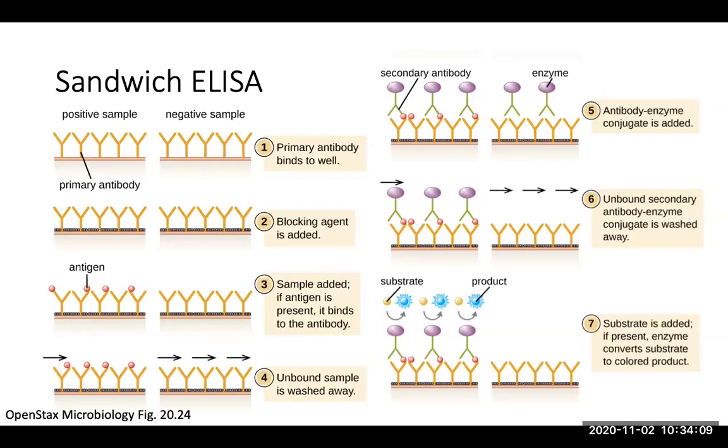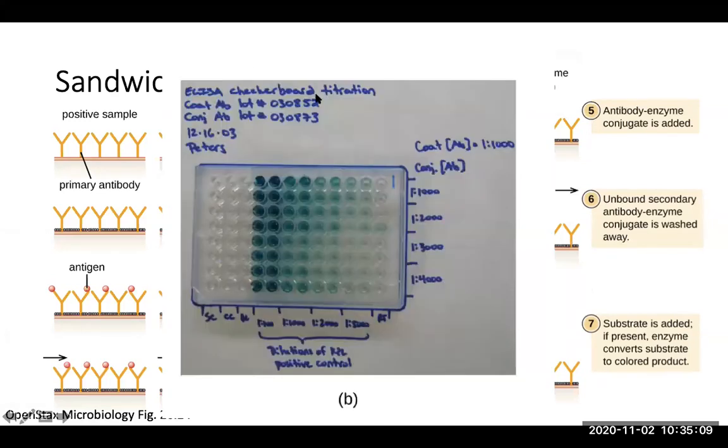In the Labster simulation, you will review different types of ELISAs and also learn how to set up and interpret a sandwich ELISA. So let me review what a sandwich ELISA is and how it works. Remember, in the sandwich ELISA, you have a well that's in a microtiter plate similar to this one.